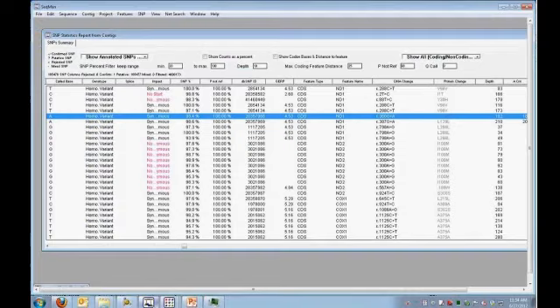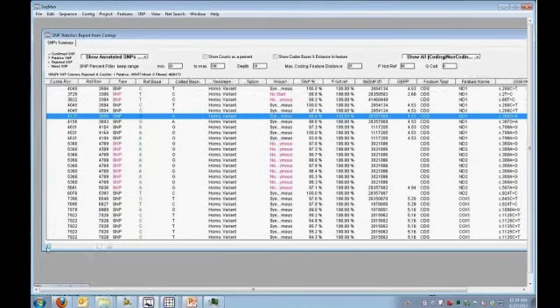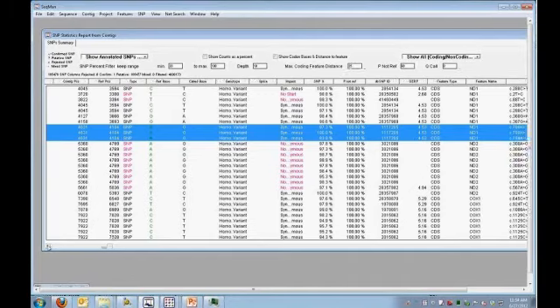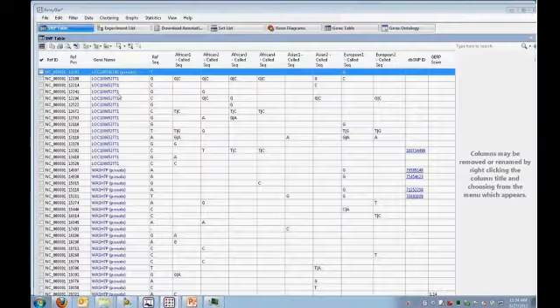If you remember back with SeqMan, if we look at these reference positions, I'll just scroll here to the left a little bit. You can see that for a number of these SNPs, we've actually got 3 rows for a variant call at the same position in 3 of our samples. And so it's a very flat report, so it doesn't condense anything in any way. But when we go to ArrayStar, now we have essentially a summary at each reference position, reference call, the call on each one of the samples.